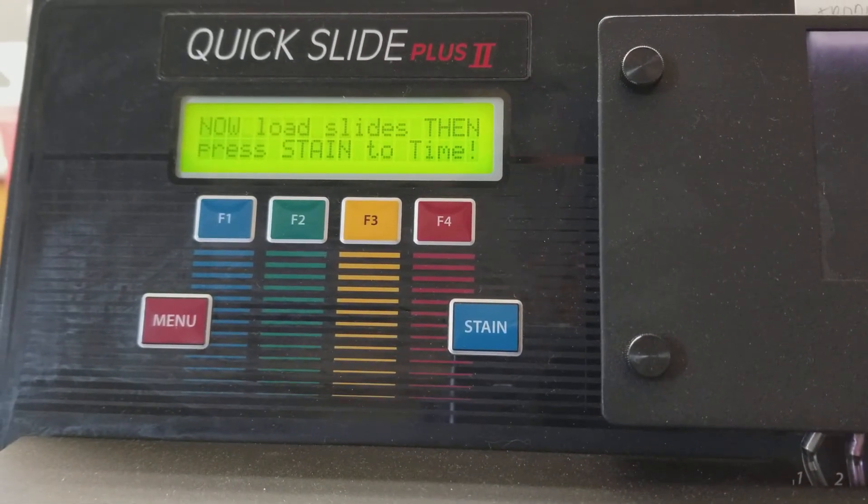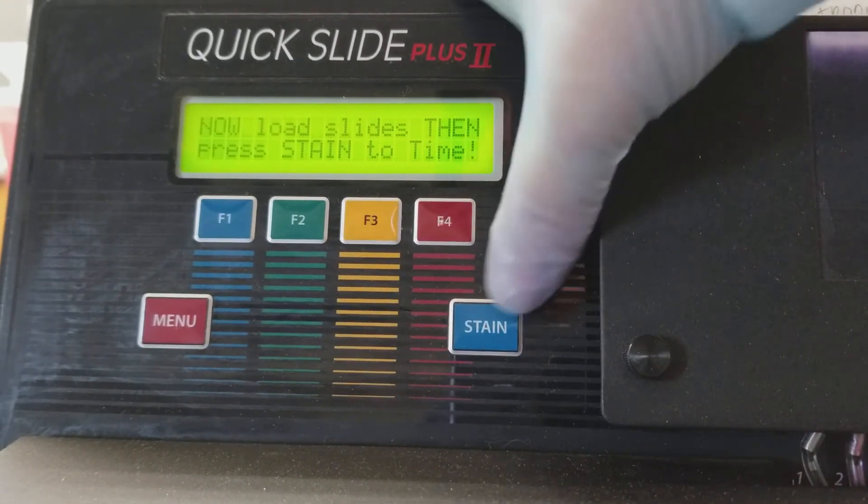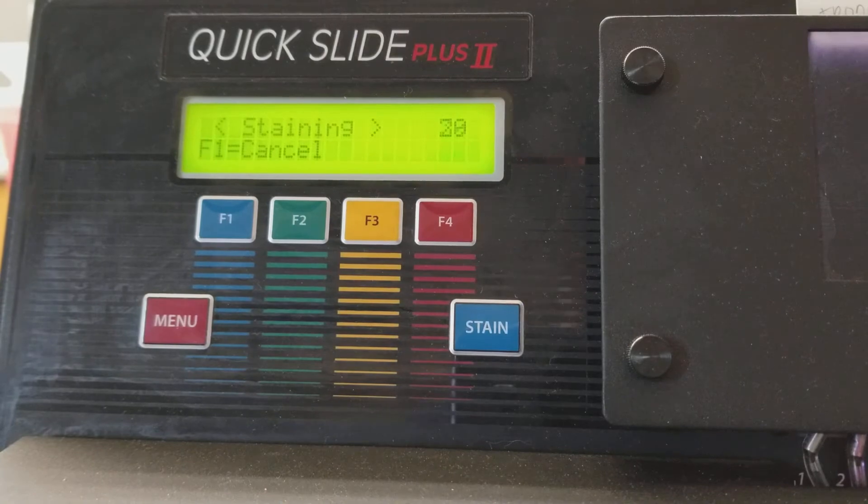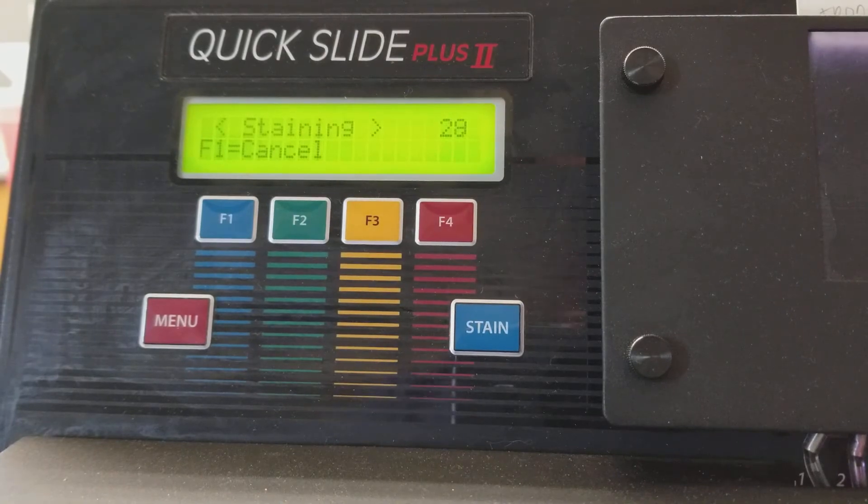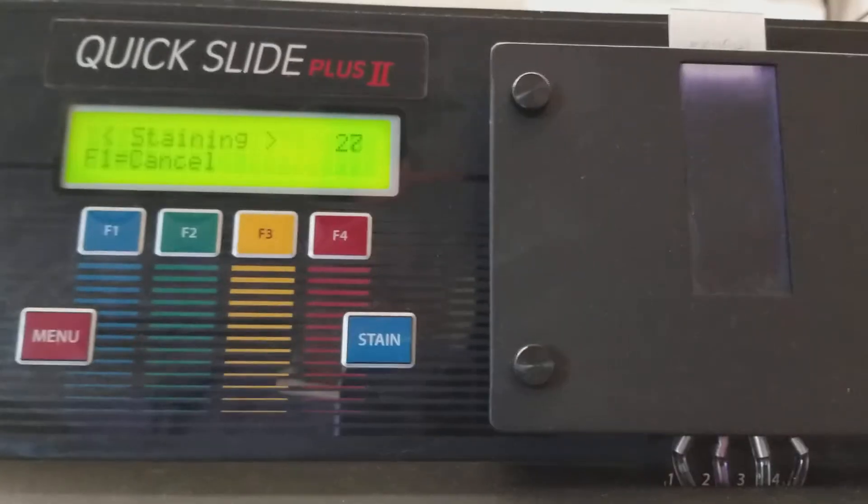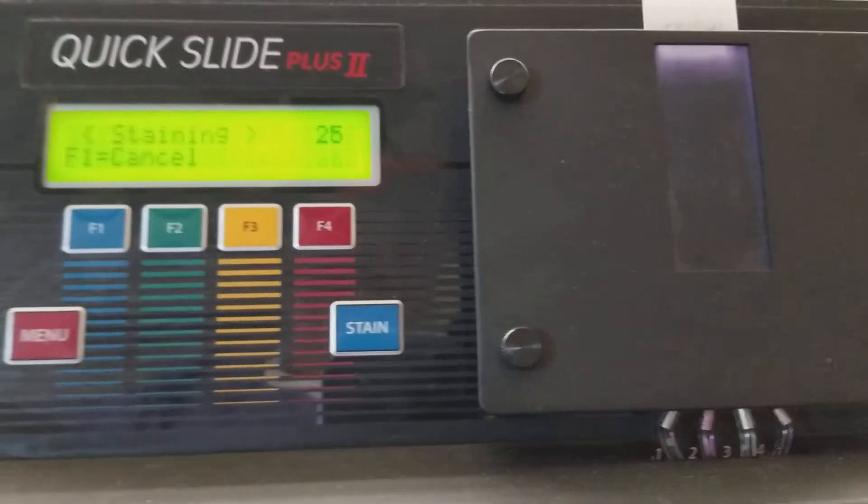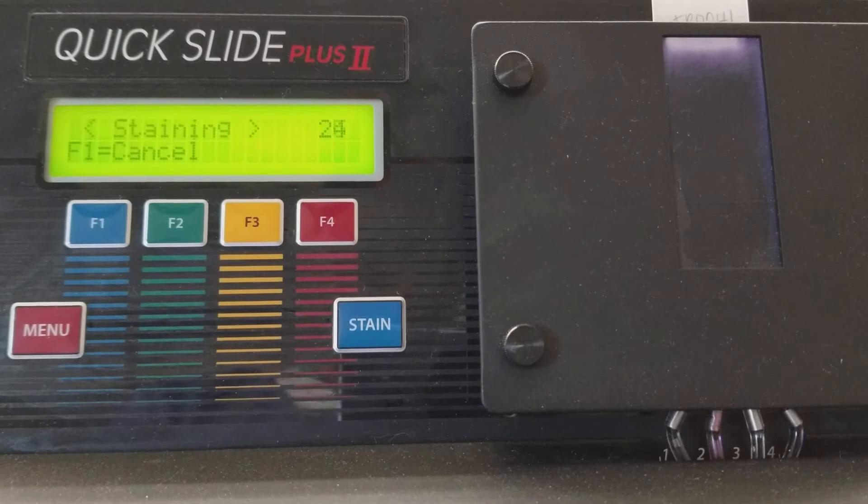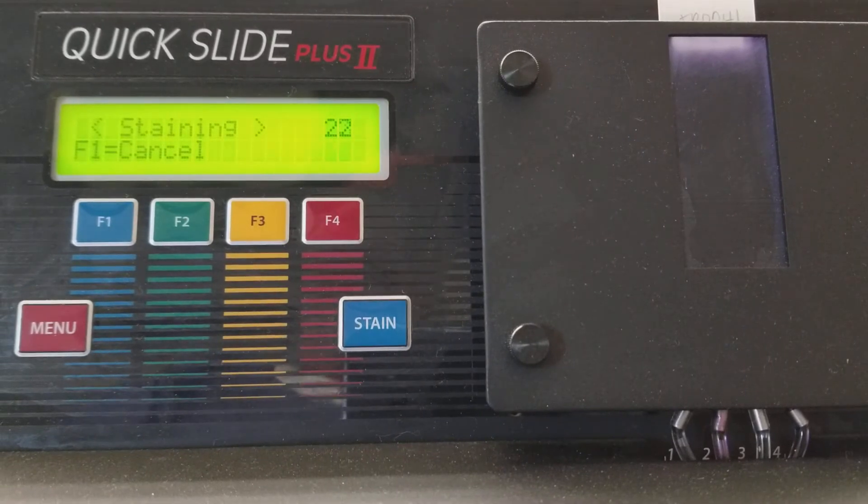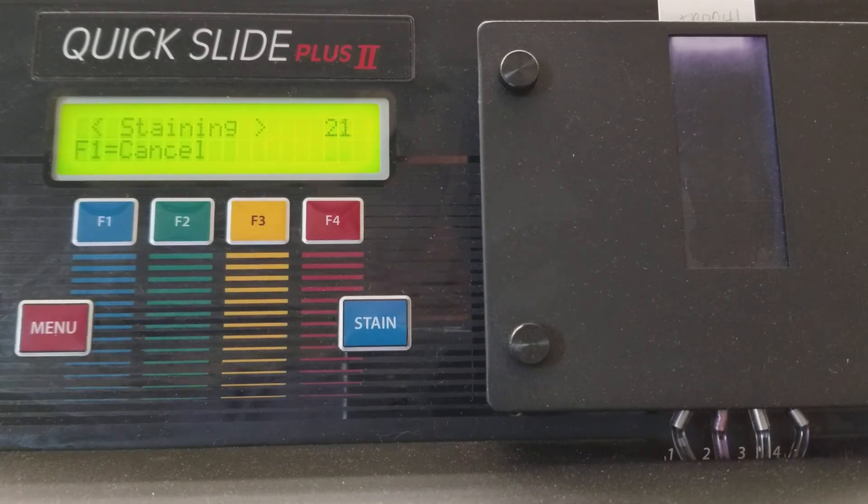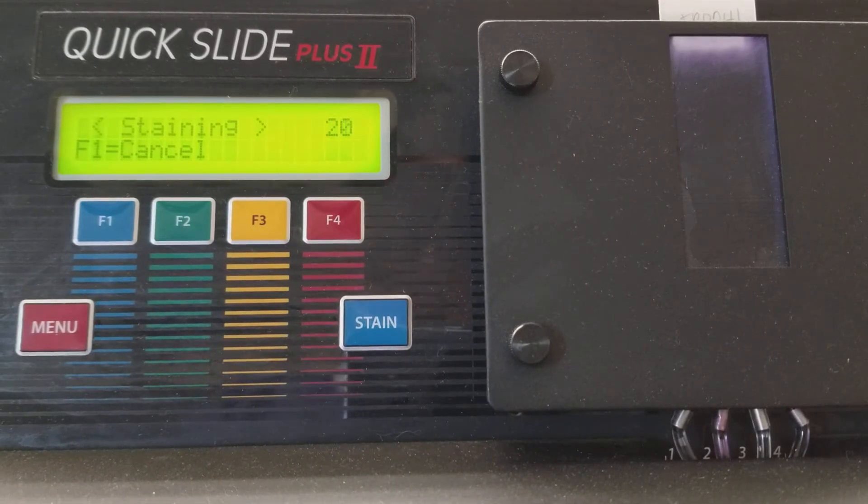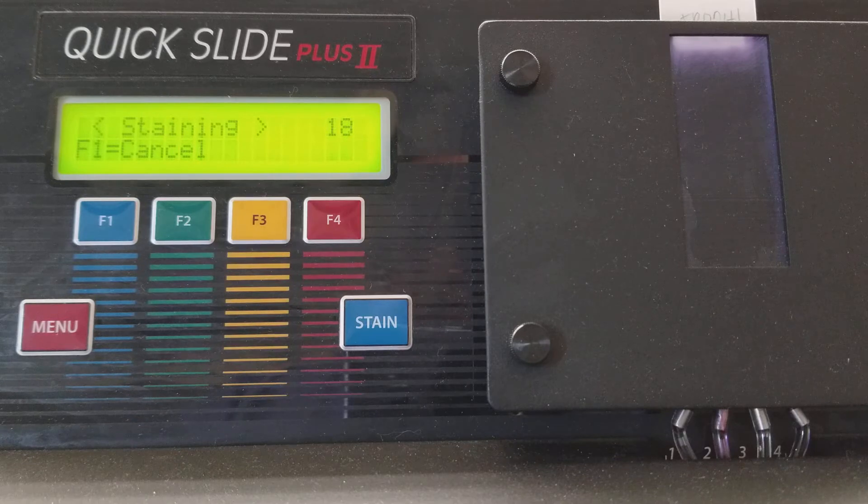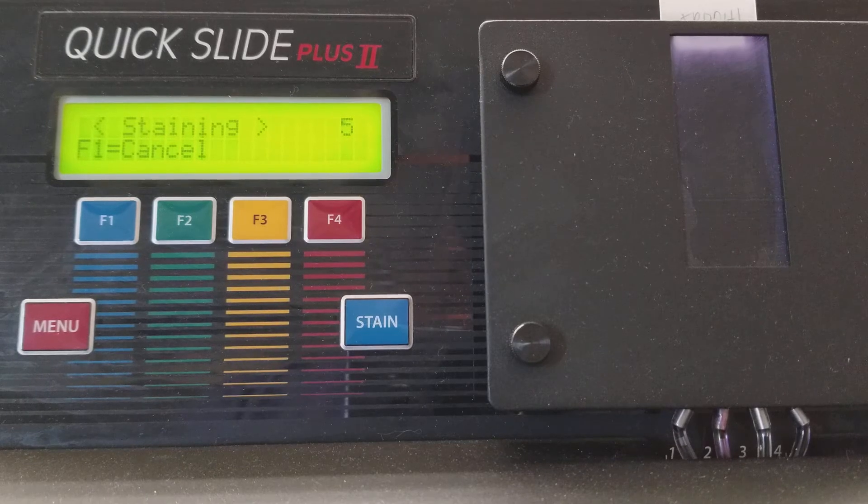So press stain when you're ready and now it's going to stain. This is going to be a few steps and it's going to constantly count down in each step and I'll get back to you when it goes to the new step.